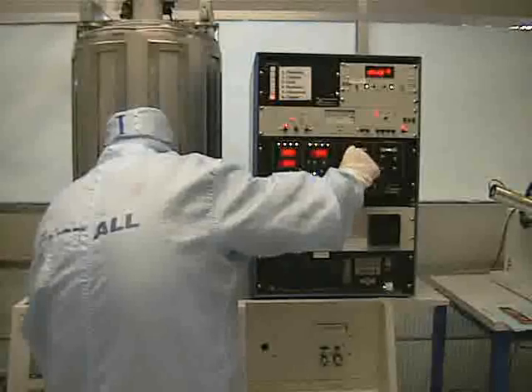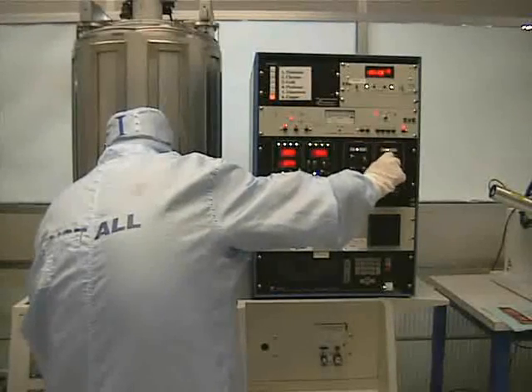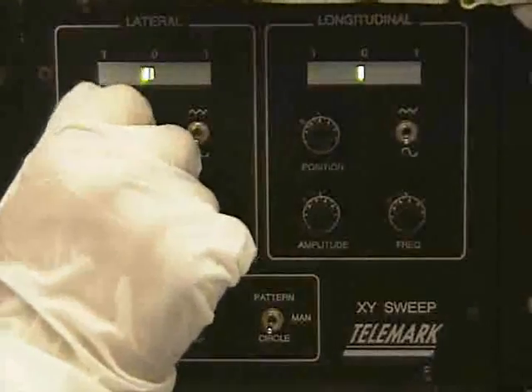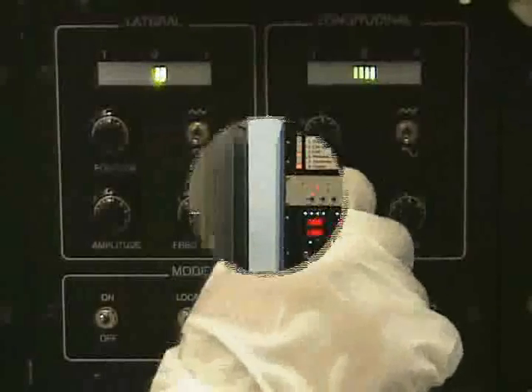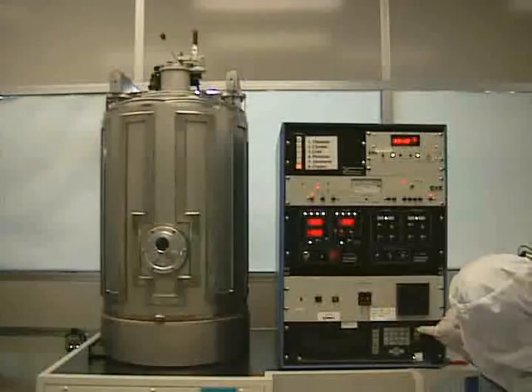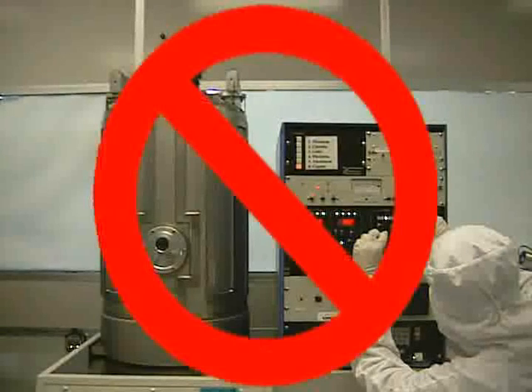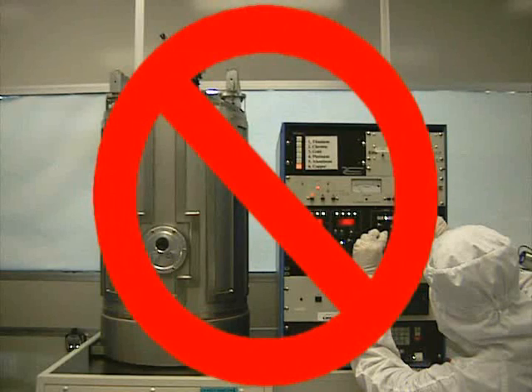We can now adjust our beam. Center the beam using the latitude and longitude knobs. You need to be simultaneously looking inside of the chamber and rotating the knobs. Once you have done this, widen the beam using the amplitude knobs. Widen the beam as wide as possible without hitting the crucible. Make sure you are looking at the beam while adjusting the knobs — doing otherwise can cause damage.